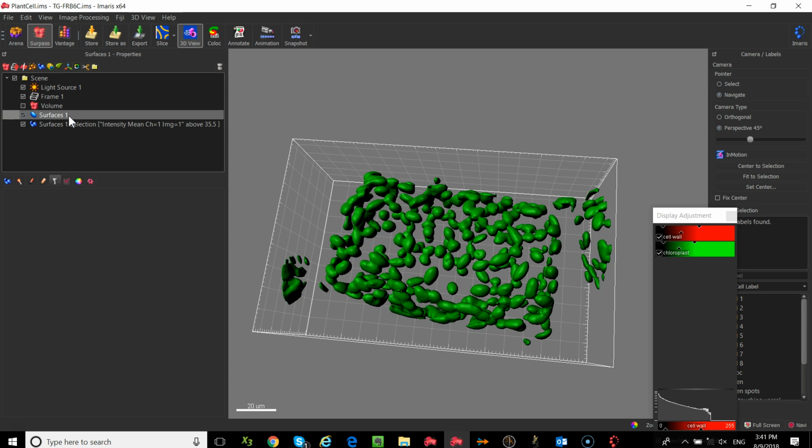If you click on the filter tab and choose a filter to select some of your objects, you can then switch into the edit tab, which is right next to that, looks like a little pencil, and hit delete. So you have multiple options. You can either make a new selection or make a new surface with the ones that you care about, or you can select the ones you want to get rid of and go into edit to delete them.